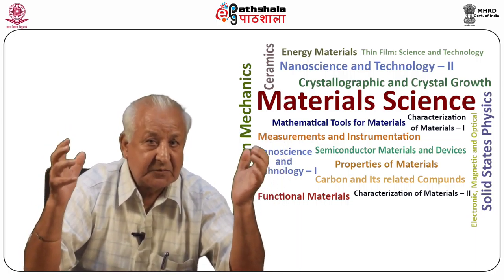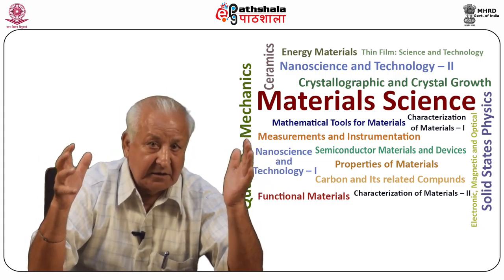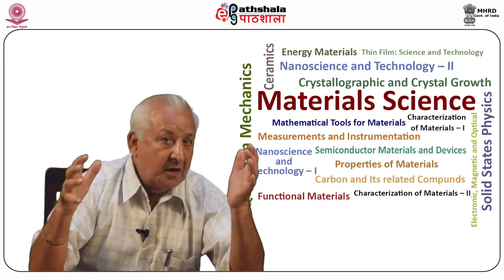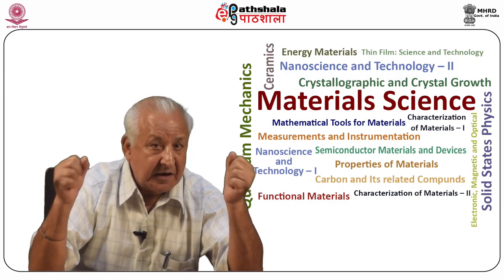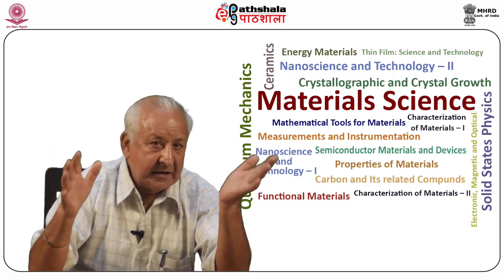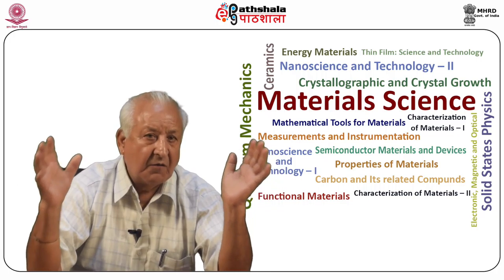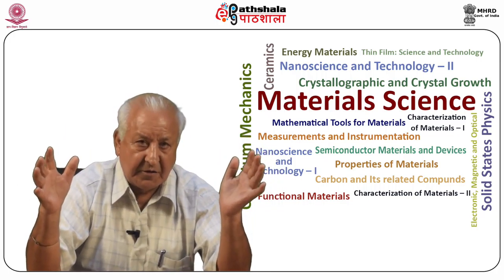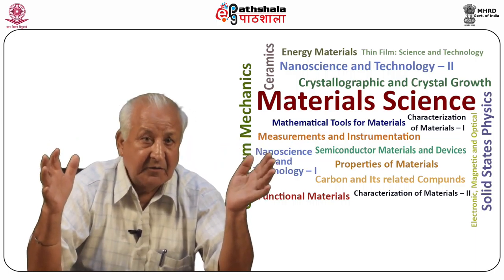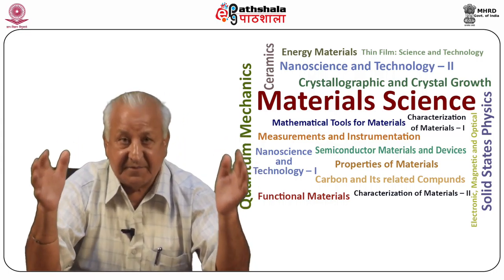This resolution is poor as compared to the resolution attainable in the case of TEM, that is the transmission electron microscope, which at best is in the range of 2 to 5 angstroms. A routinely operated TEM provides a resolution somewhere in the range of 10 to 50 angstroms. Comparing this with the resolution attainable with an optical microscope, it is at least 10 times better.